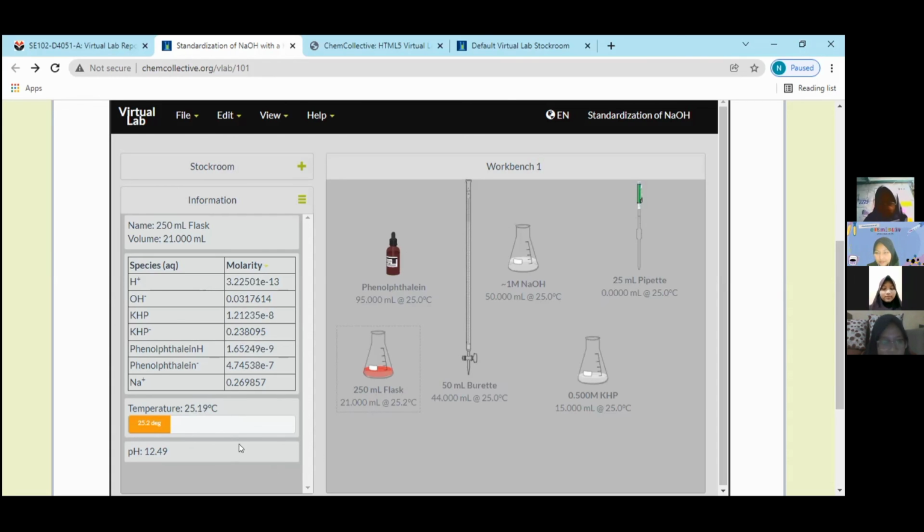Okay, thank you. So this process ends with the color change of the titrant and the titrate. Do you know those terms? The titrant is the solution whose concentration we know, and the titrate is the one that is unknown. After this, we only calculate the data, isn't it?